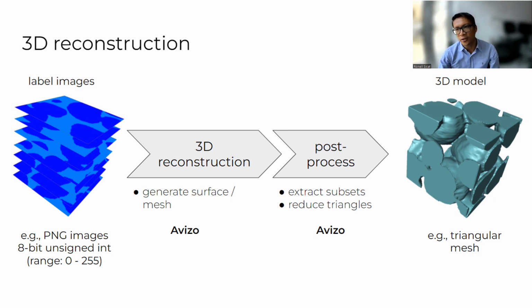So that was the reconstruction part in the workshop. And now we're going to go to the last part. And this is around 35 minutes. And here we will talk about how to use the Unity game engine to build a very simple VR application in 30 minutes or even less. And just keep in mind that this is sort of a quick hack, just to show you that you can use existing plugins or existing assets in Unity to quickly build a prototype where you can bring in the 3D model of your data set in virtual reality.